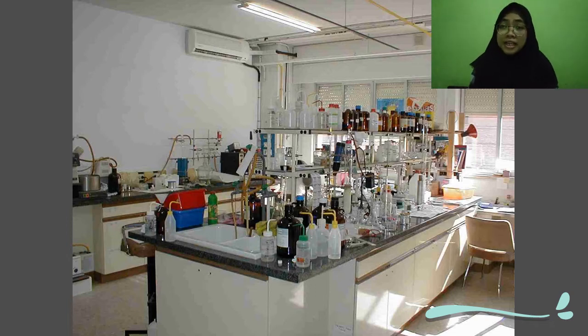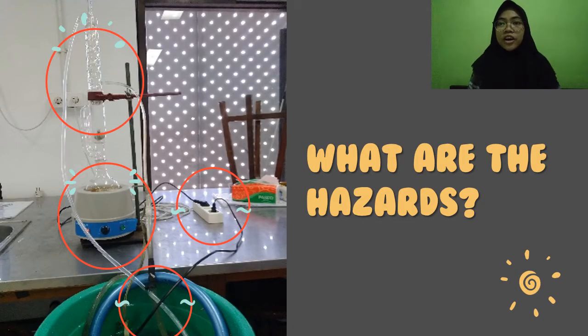Now, we will be more specific to discuss hazards in chemical laboratory. But why chemical laboratory? Maybe because this place is the most familiar place to me. I used to go to this place almost 5 or 7 days a week when I was in vocational high school. And in the waste treatment engineering major, we also have a lot of laboratory classes that use chemicals. This picture is one of my documentation of chemical lab. This was when my team extracted oil from kenanga flowers by using the soxhlet method.